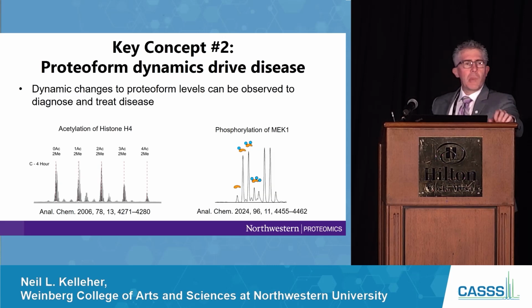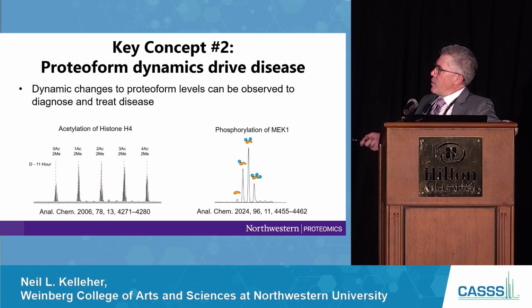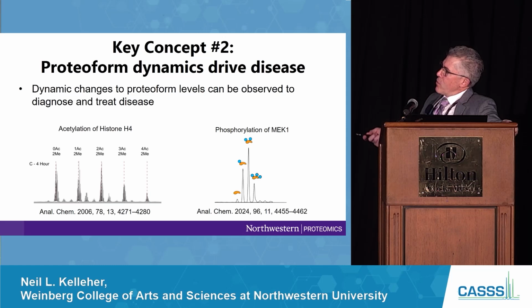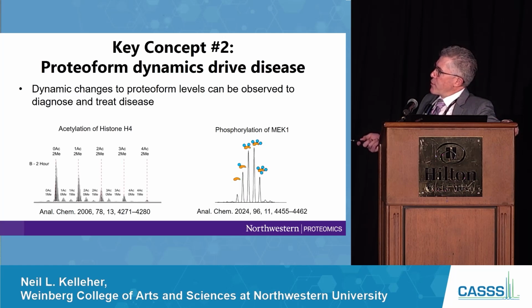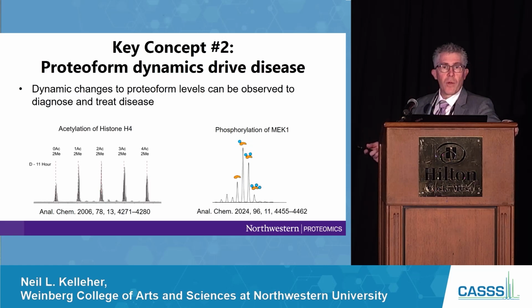So, and I'll make a couple analytical points. MEK1 is in the MAP kinase cascade. That's its phosphorylation profile, and it's changing over time as you treat with MEK1 inhibitors or you get relapsed melanoma. Many of you aren't necessarily geared up to interpret these spectra. These are large molecule mass spectra obtained by LC or CE, top-down MS. And so you can get the stoichiometry. If you just look at these profiles, in any spectrum, you can get the 1, 2, and 3, and there's a fourth. In relapse, you get a fourth phosphorylation proteoform there as well.